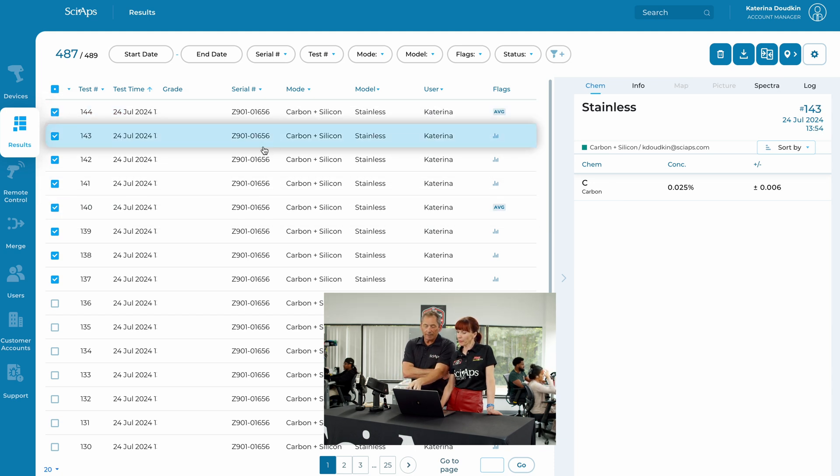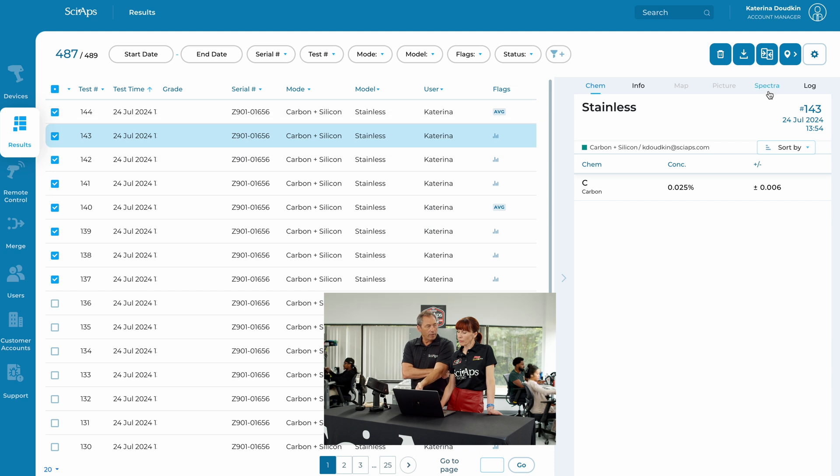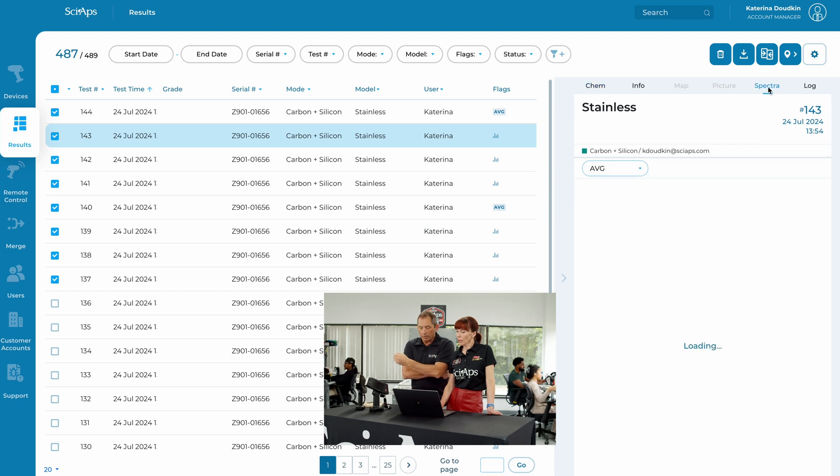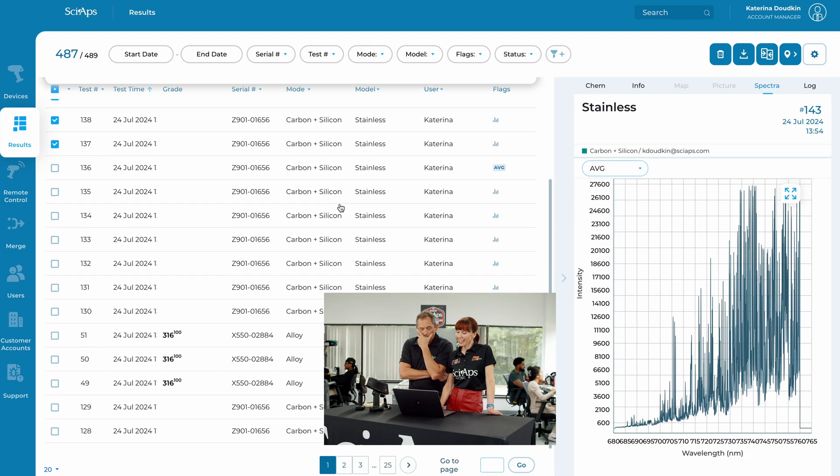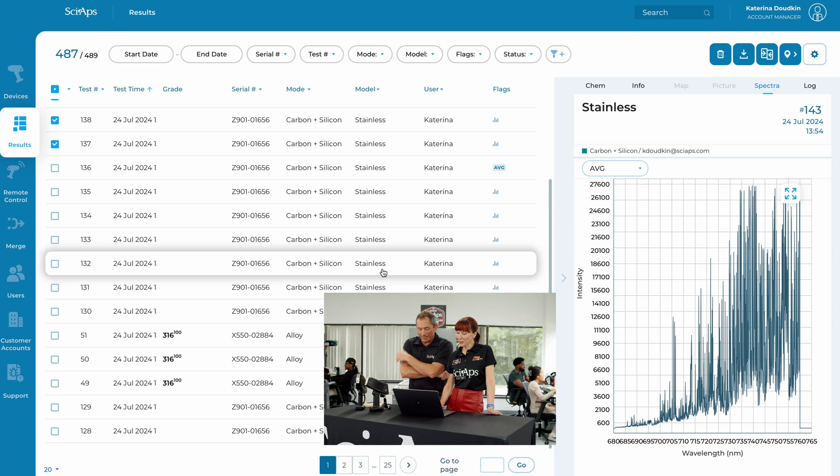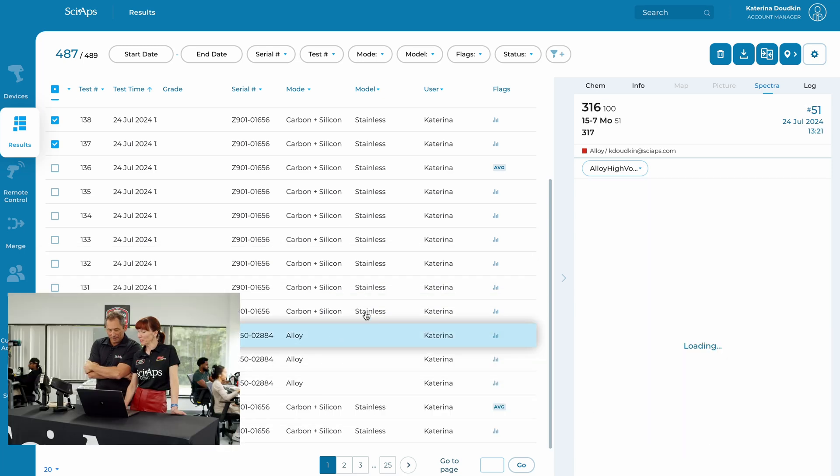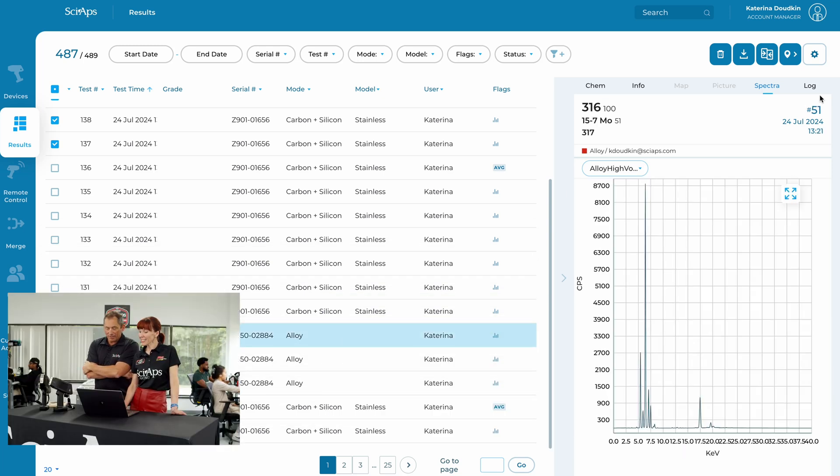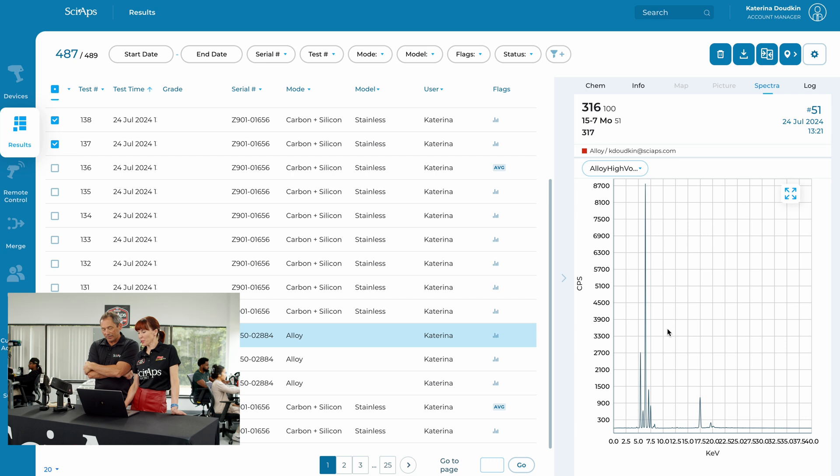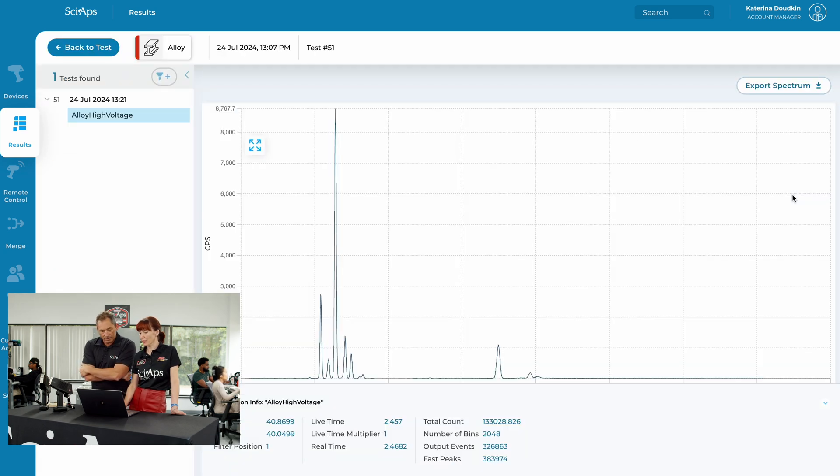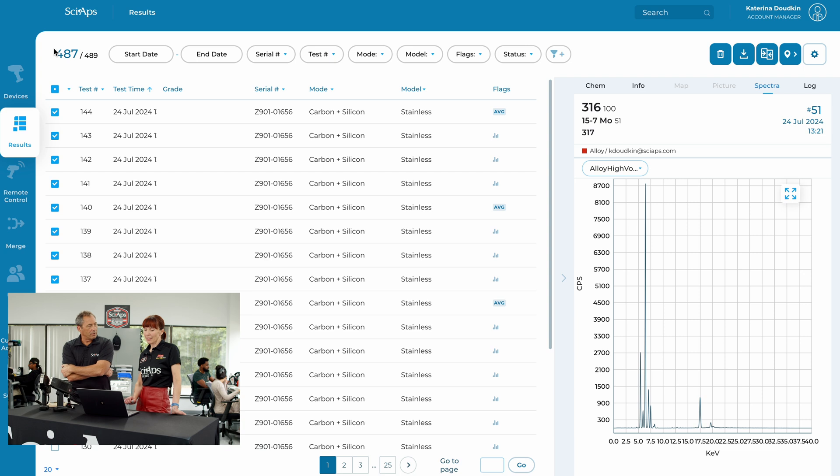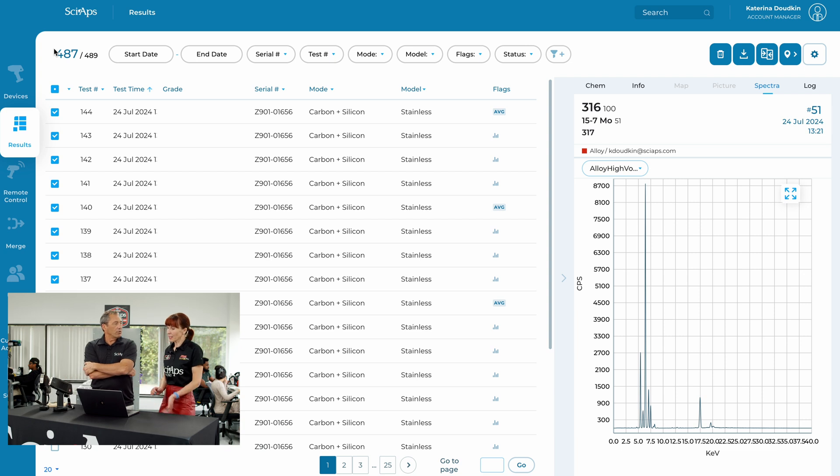Can you even set up a little template so you can print a report right away? Yeah, you could. You could also look at the spectrum. Well, we should look at another spectrum. Oh, well, that's an X-ray spectrum. It's so much nicer. And you could also look at a full screen view. Nice. All right. That's beautiful.